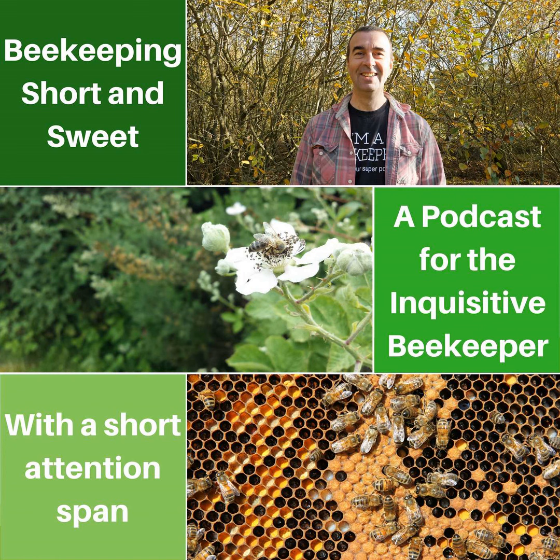Sure. Well, the first thing would be a high-power microscope. Now, that makes it sound as though it's going to be very expensive because it's high power. High power just means the upper limit of the magnification. And even the more basic high-power microscopes will magnify up to times 1,000. Right. And the one that we sell most to beginners in beekeeping is the SP22, which is £120 or thereabouts, including the VAT. And that will magnify from times 40 up to times 1,000. So it'll be fine for pollen.